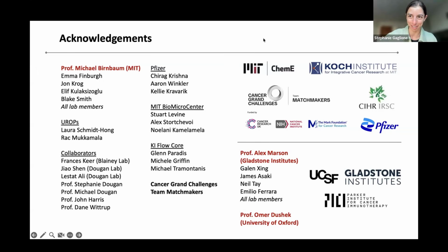This is in the paper. I don't know if I put it quickly and accessibly in my supplement here, but we could show that we could pull out the exact same TCRs using an approach that has worked pretty universally, even for low affinity antigens. I will put the caveat that we were doing this in Jurkats, and Jurkats do have some lower sensitivity, and that's something that I'm sensitive to.